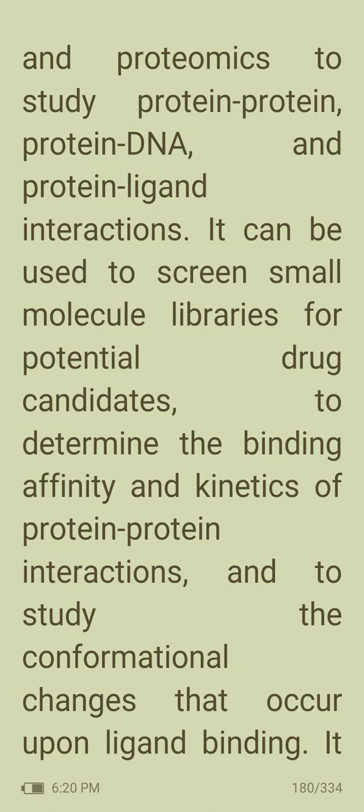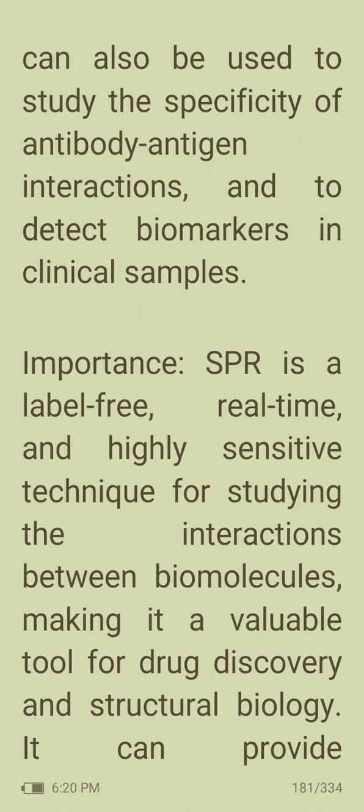It can be used to determine the binding affinity and kinetics of protein-protein interactions and to study the conformational changes that occur upon ligand binding. It can also be used to study the specificity of antibody-antigen interactions and to detect biomarkers in clinical samples.